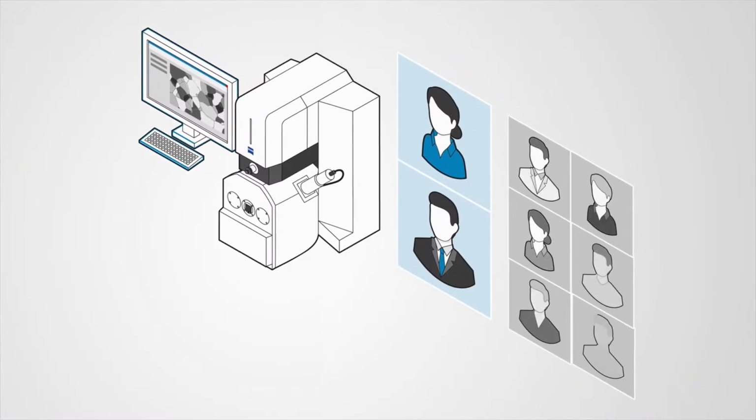Your microscope may be run and administered by a core of skilled super users, but new users, guests, students, or staff from other departments may also want to use it. How can you ensure the system is used efficiently to its full capabilities in such a multi-user environment? How can you ensure a consistent sample-driven workflow?